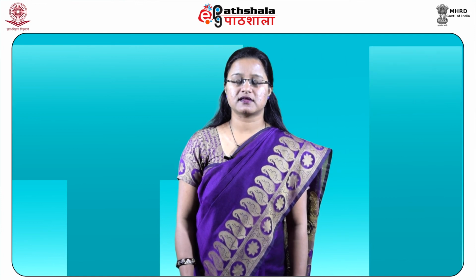The first and foremost procedure used in purification relies on differences in solubility of the enzyme in a salt solution. Ammonium sulfate is preferentially used because of its high solubility in water. Next, dialysis is performed to get rid of the excess salt.